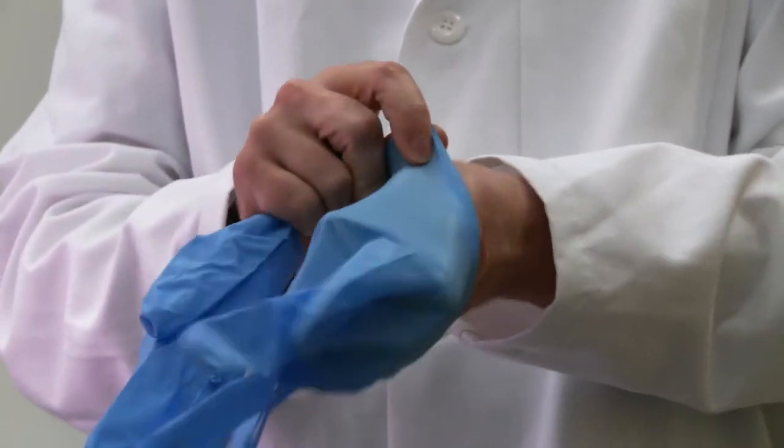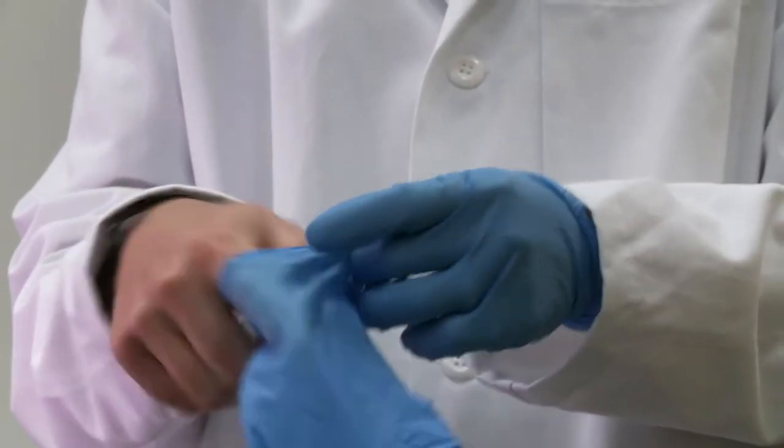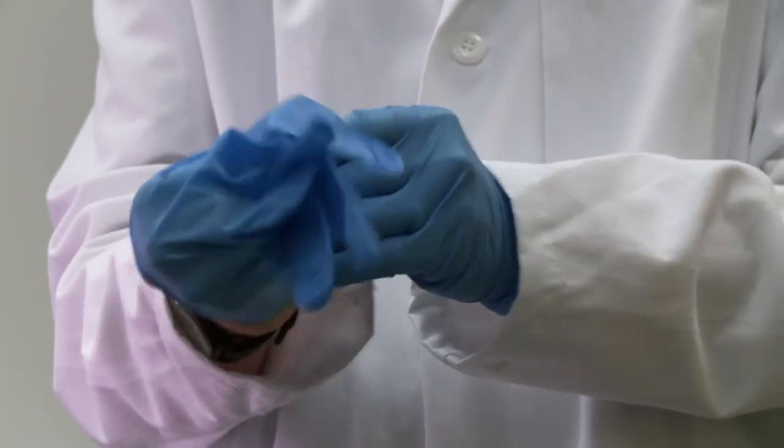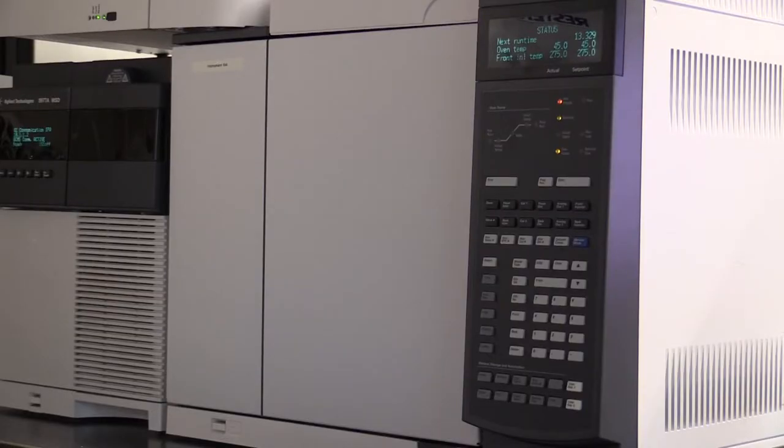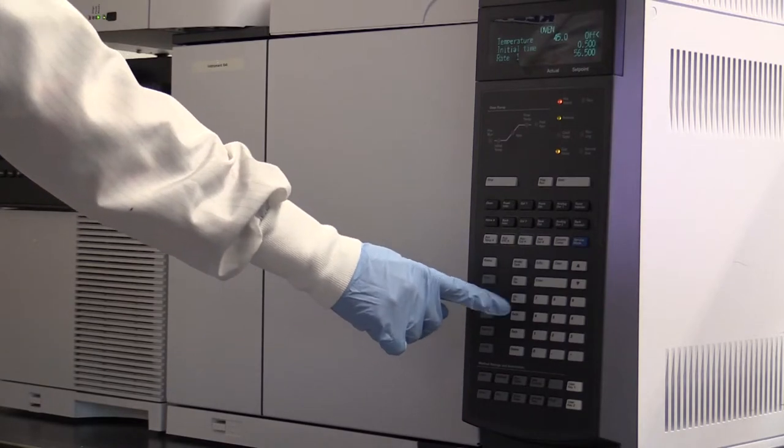Restek recommends wearing protective gloves when handling the GC accelerator kit components. To install the GC accelerator, turn off the heated zones in the oven, inlets, detectors, and MS transfer line and wait for them to cool.